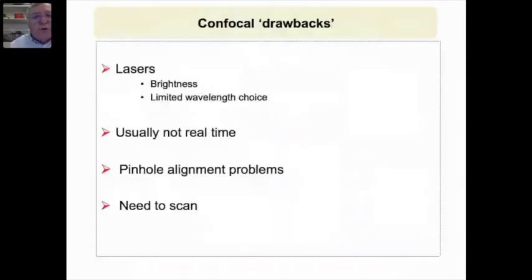So what's wrong with the confocal microscope? Well, for our purposes, it has to use a laser. For our purposes, let's imagine, because it makes the story more interesting, that they don't image usually in real time. You've got to put the pinhole in the right place and you have to scan. So what would you like to do?